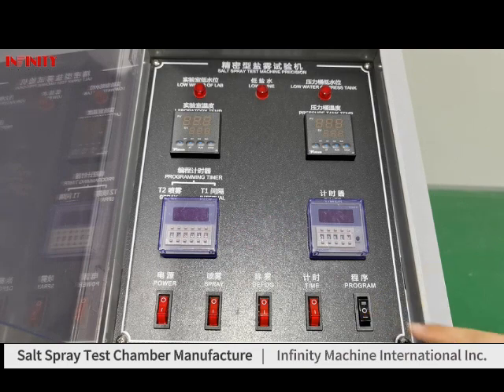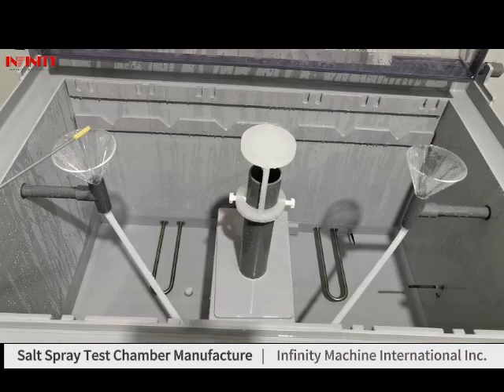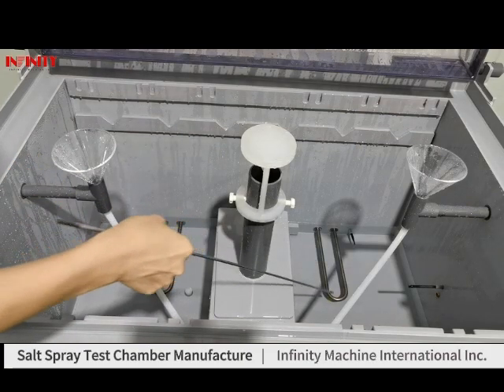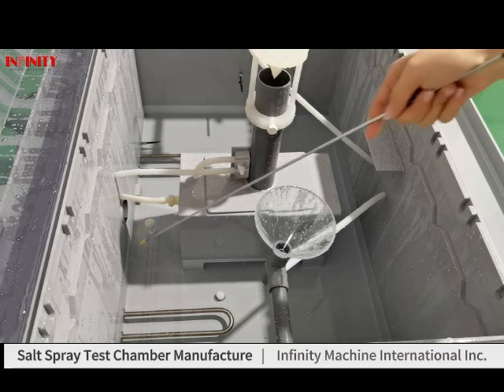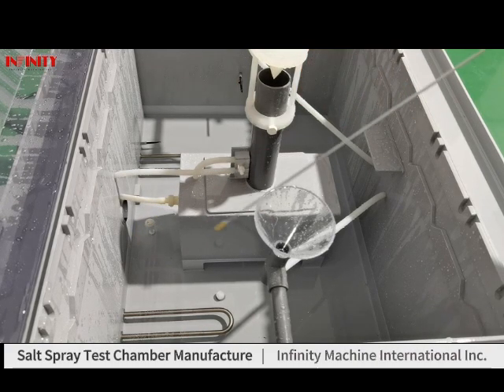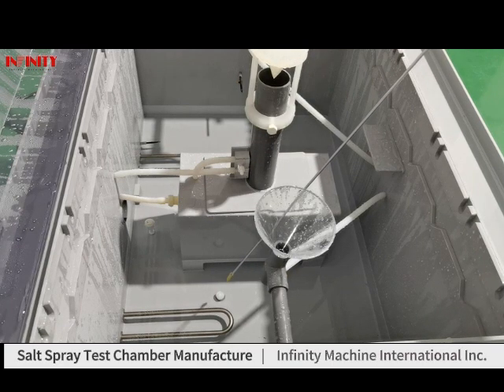The program switch has two positions. This is position one. The machine has two pieces of funnel for collecting condensate. And this is the condensate drain funnel. This is the tank — the machine has two pieces of water temperature sensors.